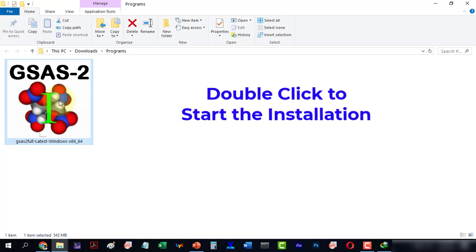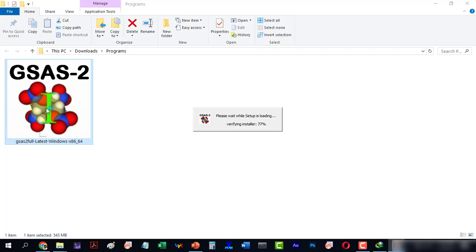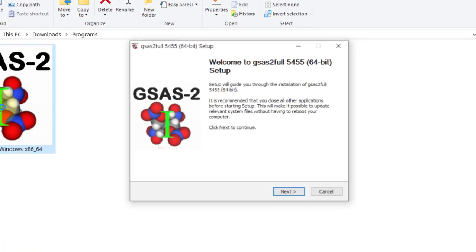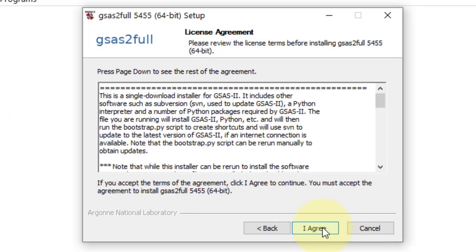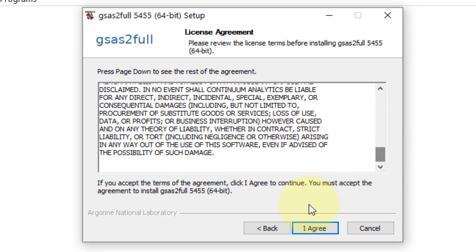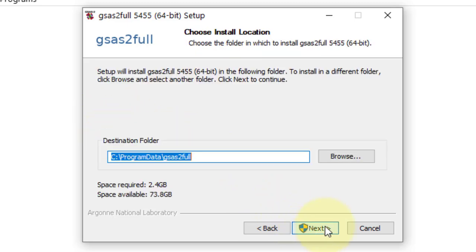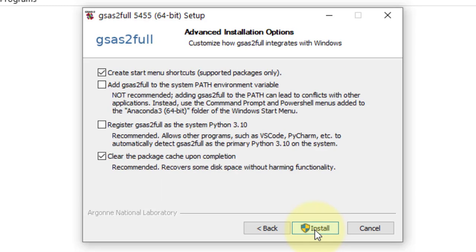Double-click to install the software. Click next and I agree. I will install this for all users. The installation location is provided and I will go with all the default options.